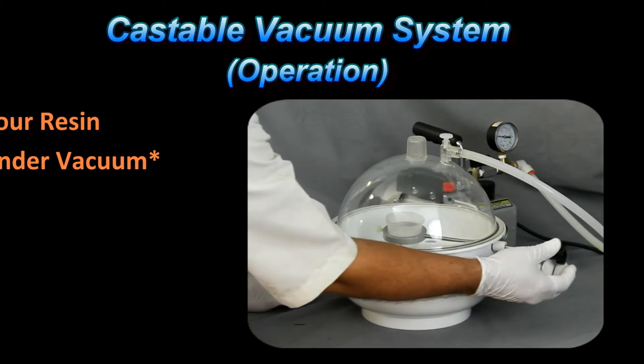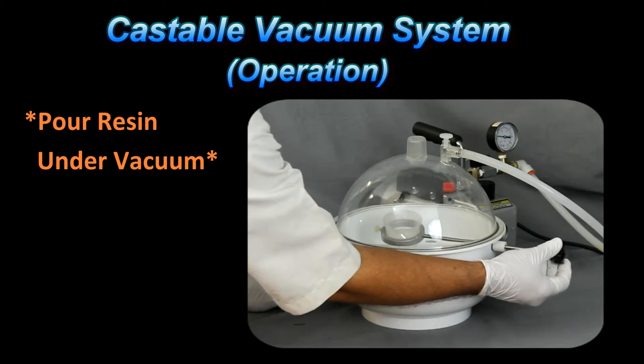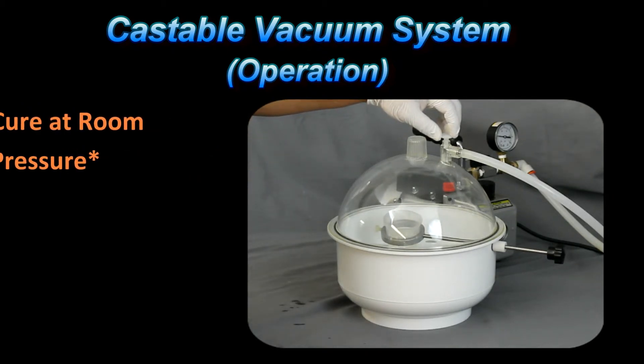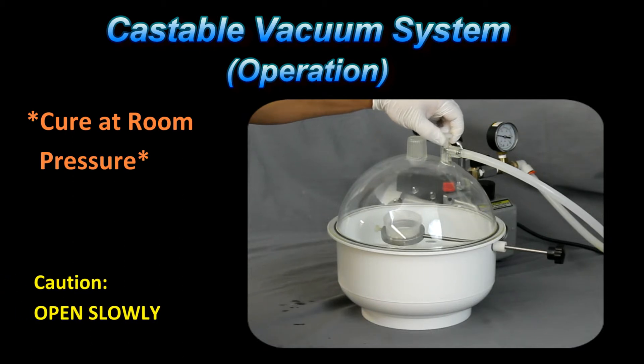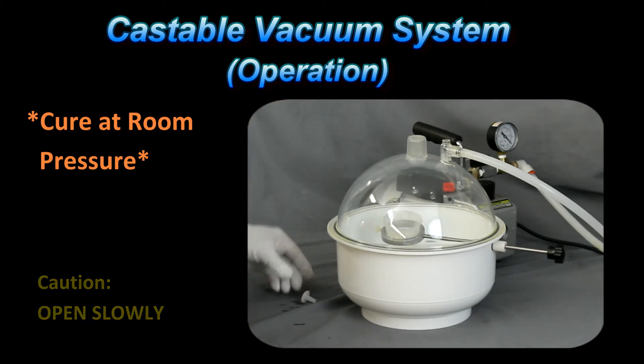At this point, while we're under vacuum, we want to go ahead and pour the resin over the specimen. If we had multiple samples, we can pour those as well. After that has been completed, we want to cure the resin at room temperature — the room pressure itself will push the resin into the voids. So let's go ahead and release the valve slowly. You can watch the vacuum gauge as the pressure is being equalized. Once the pressure is equalized, we can remove the top cover.